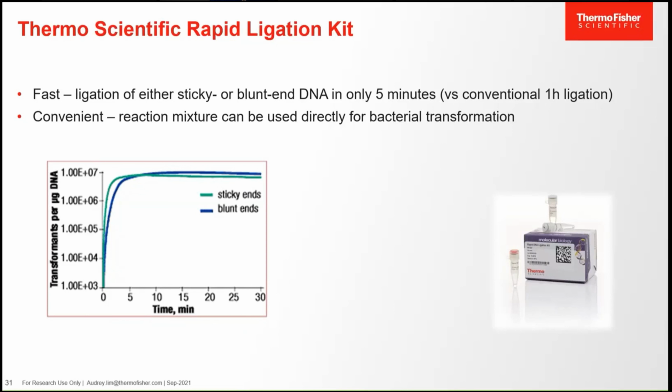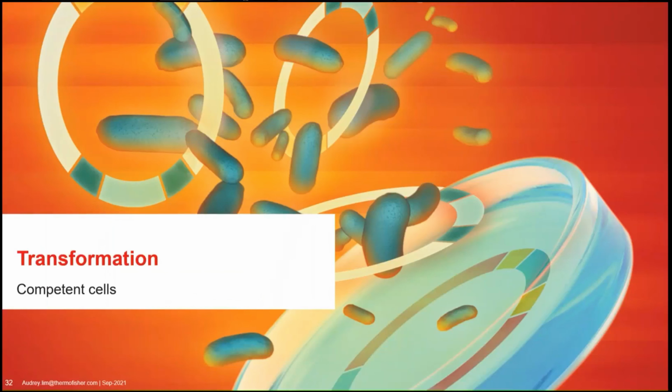Do note, however, that for electroporation, when you perform the transformation, the T4 DNA ligase will need to be inactivated before you use it. Okay, so now let's move on to the next step. After ligation, you get the recombinant plasmid. So the next step is the transformation.